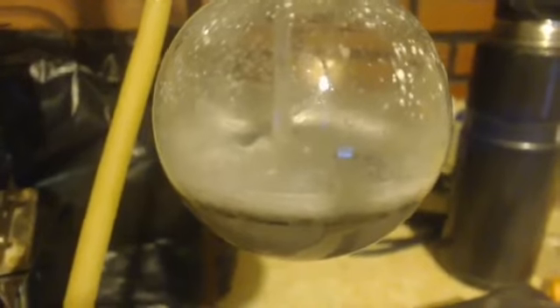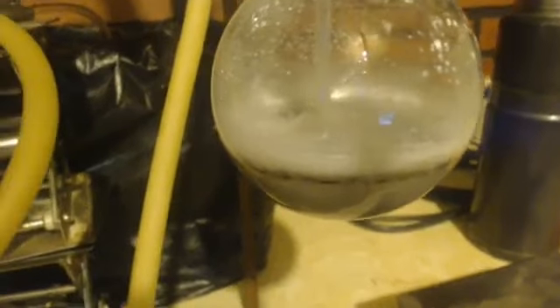Well, it's been 2 hours, but it's still making white stuff. I'm guessing that's my product. You can see it floating on top. It's all on the sides. This isn't metal, it's white stuff that was made. Well, keep bubbling it in, I guess, for another half hour, and then I'm just going to say screw it. It's 2 hours, 2.5 hours, that's long enough. It just seems like it's making more and more.